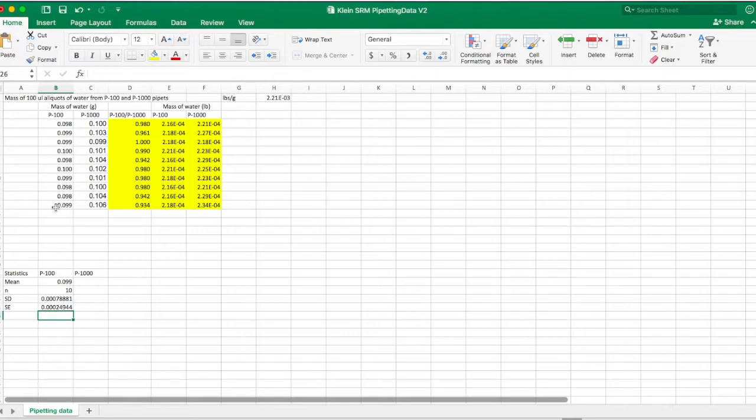Select cells B22 through B25 and drag the little box at the lower right corner of the highlighted area to the right to propagate the formulas into column C. This will calculate the descriptive statistics for your data in C4 through C13.